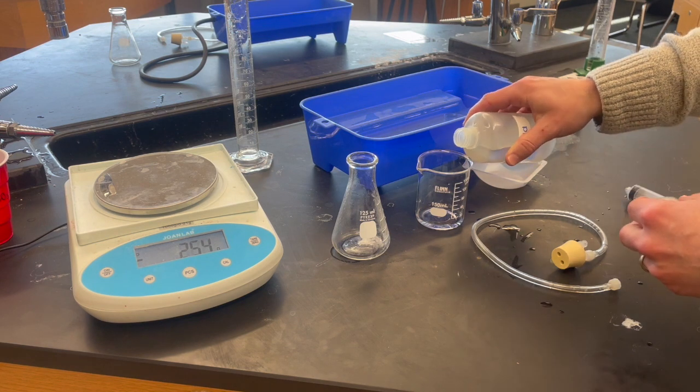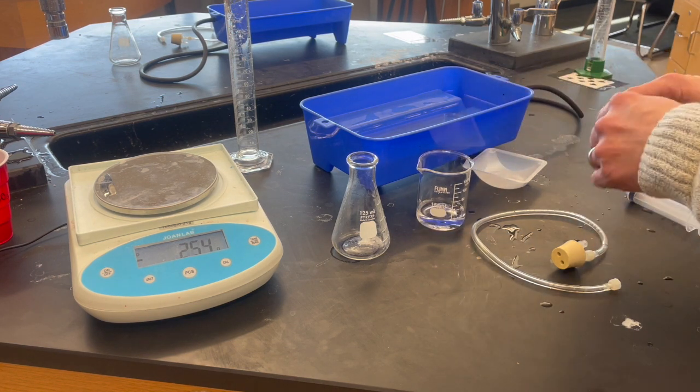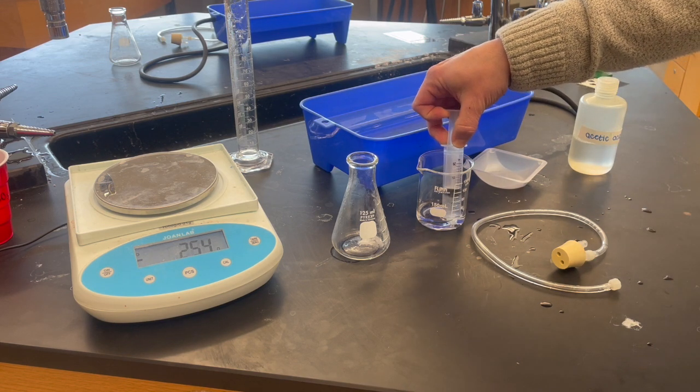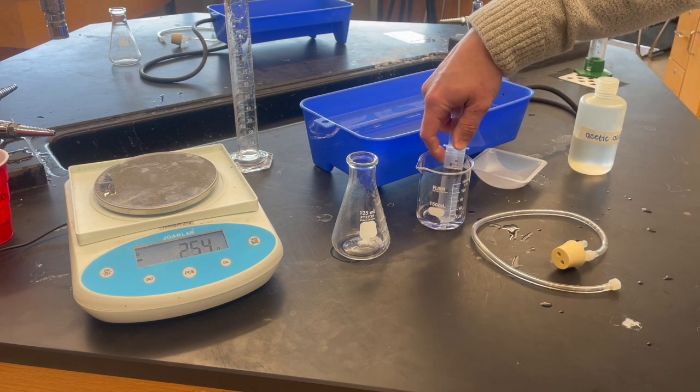The next thing I'm going to do is pour out about 25 milliliters of vinegar into this beaker, and then I'm going to use a syringe to suck up exactly 20.0 milliliters of liquid.